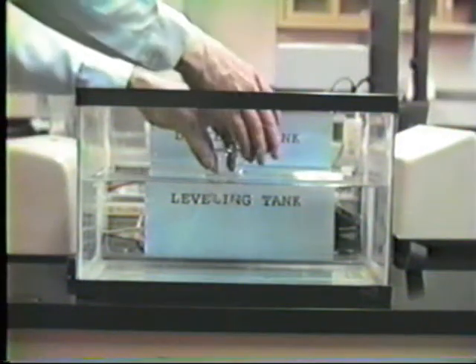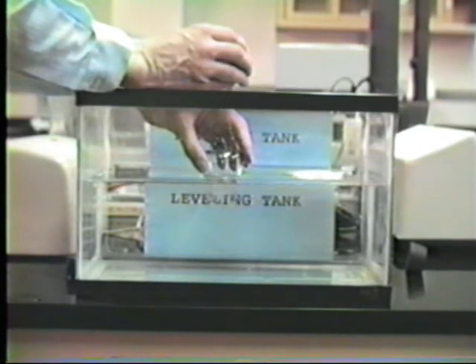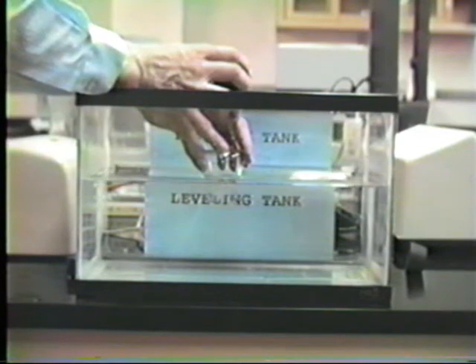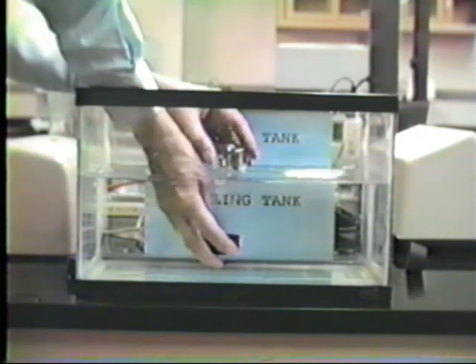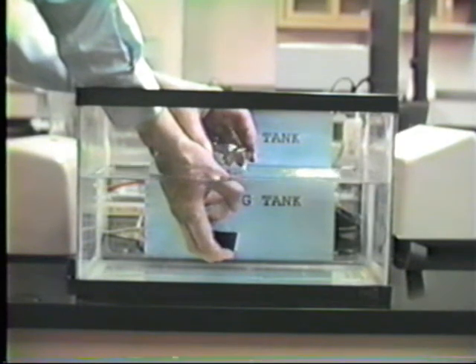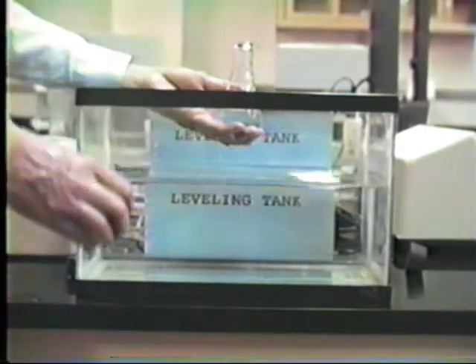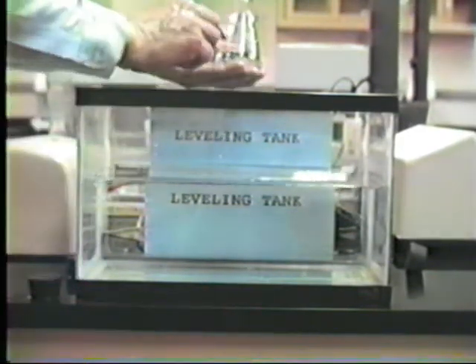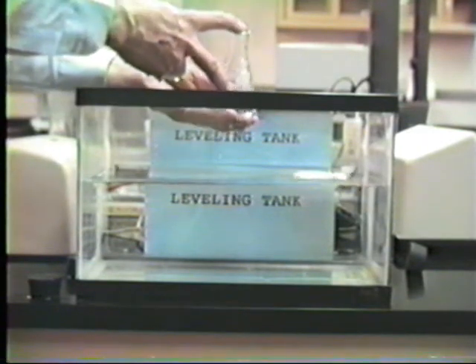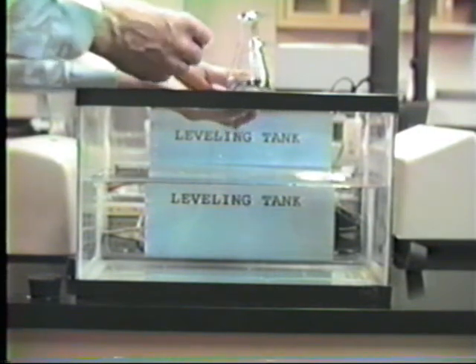Here it is once again. When we get the two levels, the level inside and the level outside, and we know the pressure of the oxygen inside the flask is atmospheric pressure, we simply cover the mouth of the flask with this large stopper, bring it out of the tank, and then we can release it to atmospheric pressure. At this point, this is the volume of oxygen which we've generated here, and we will be able to measure that.